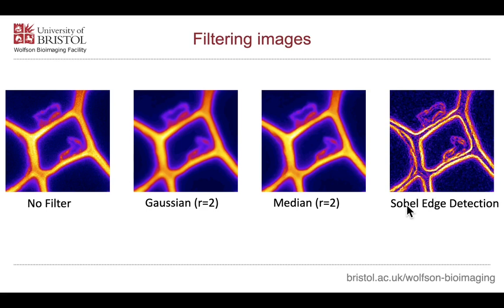This works quite well in images like this, where you have really good signal to noise, signal to background. Generally, when you put in live cells, this kind of thing falls down. There's a lot more detail in a cell than you would really realize. So you pick out all kinds of edges, but it can be useful to try.